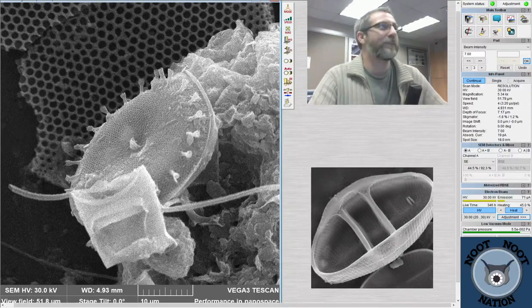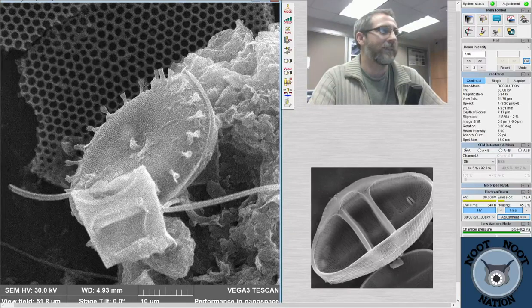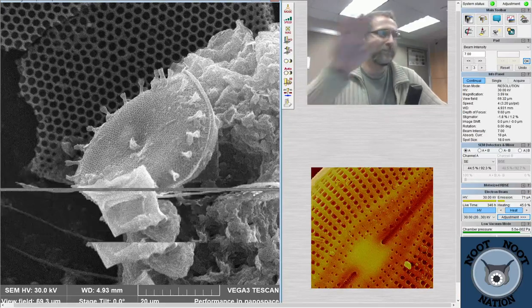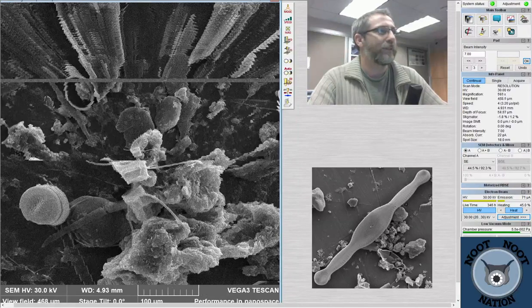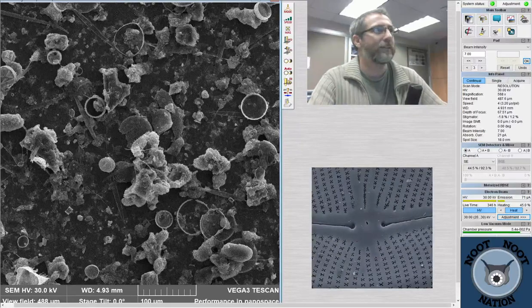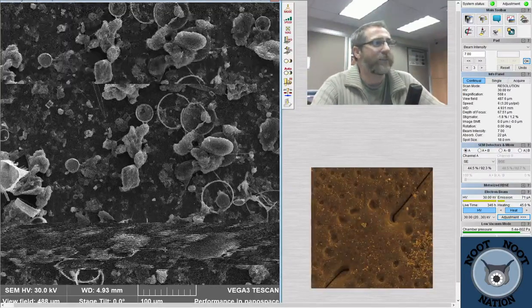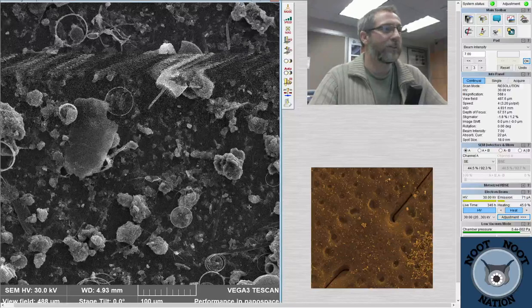One of the things that's cool about this is you can see how many different body plans there are with Thalassiosira. It's got this one with these crazy tulip-shaped tubes coming out of it, and this big tube, and then we saw many other Thalassiosira as we were scrolling around on this stage that are present, including this one that's behind it, and many of these things here, that's probably Thalassiosira. There's a whole bunch of them, but they all have a very different characteristic look to them, but they have the same components, which is how we usually separate things into genus.